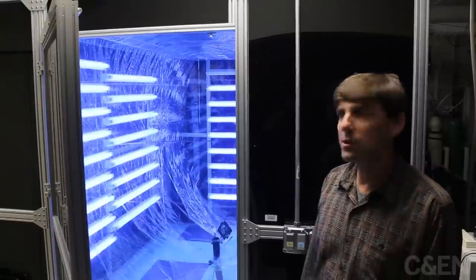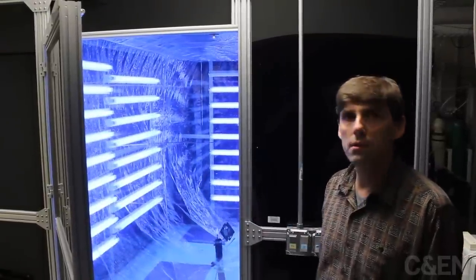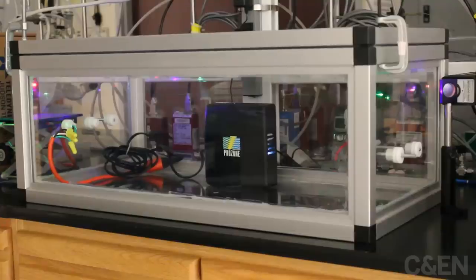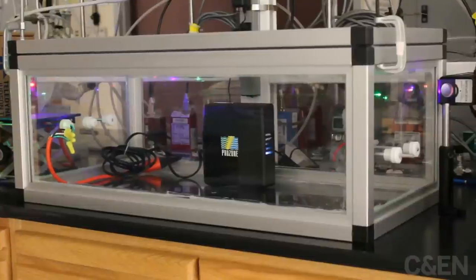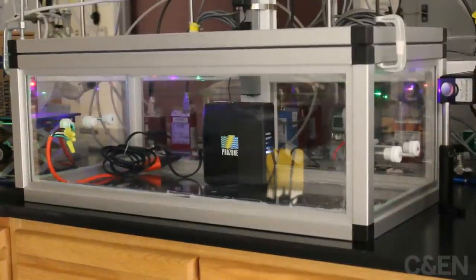And in our day-to-day experiments, we have to make aerosols all the time. We do it in a large aerosol chamber, the one that you've seen in the presentation. We also make them in much smaller chambers like the demonstration chamber that you've also seen.